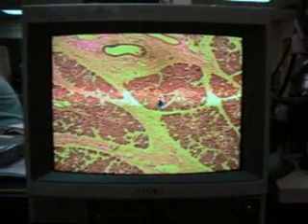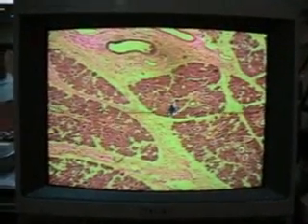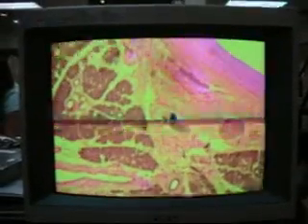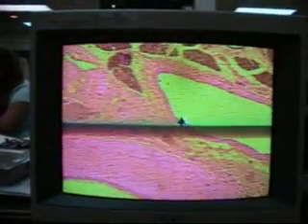This is a salivary gland on 4X magnification. We're just going to scan around a little bit and we'll be able to see a very nice large artery here. Next to it we'll be able to see a nice size vein right there.